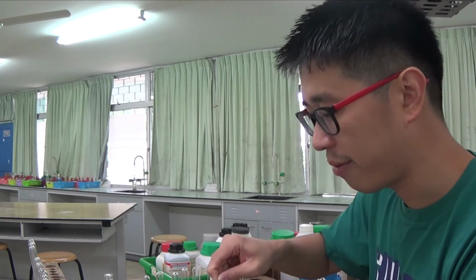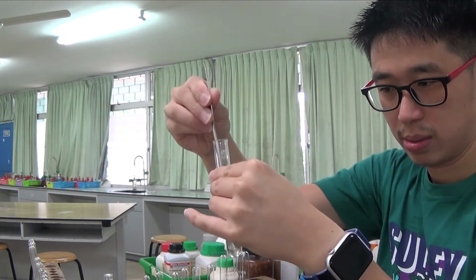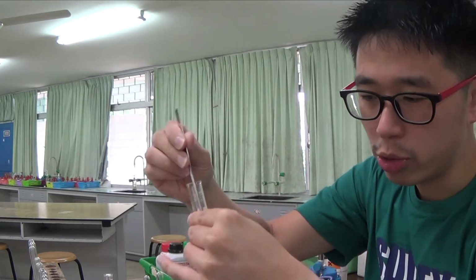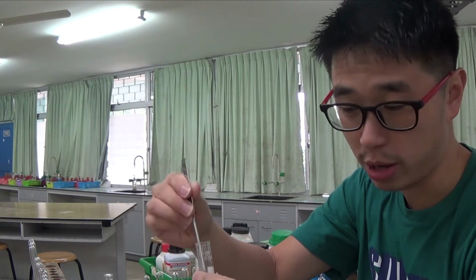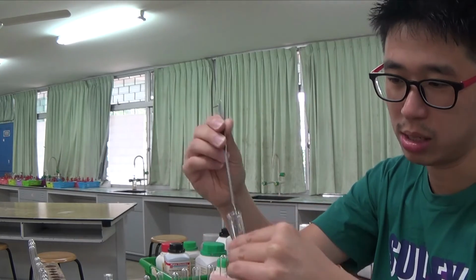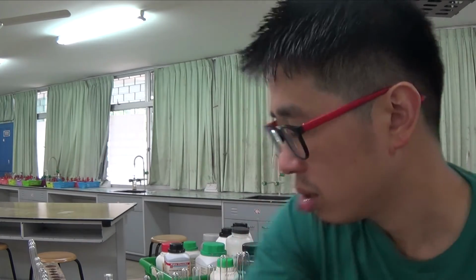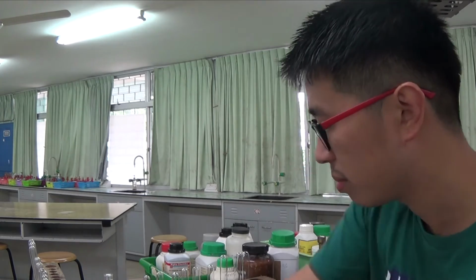Just want to ensure that I've got enough. All ammonium salts will be soluble, but not all aluminium salts are soluble, obviously. But I think this one should be soluble in water. Just need to make sure that they are soluble. Put the spatula aside because I don't want to contaminate anything at all.